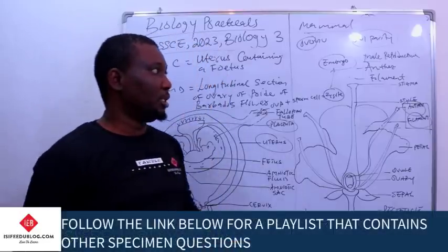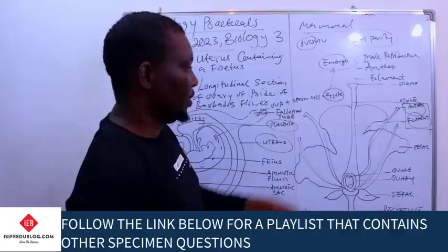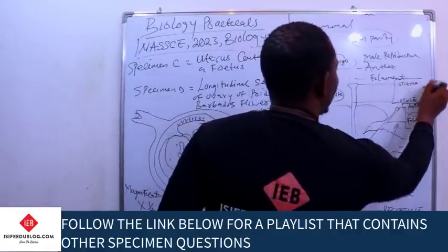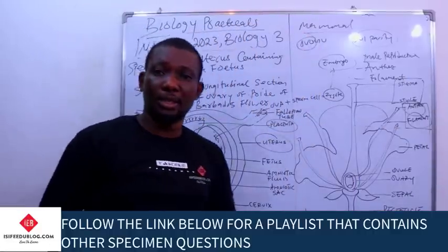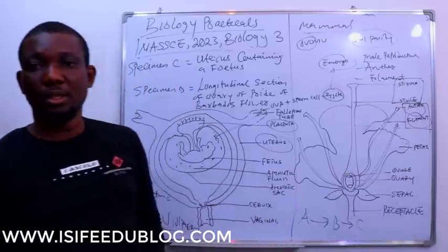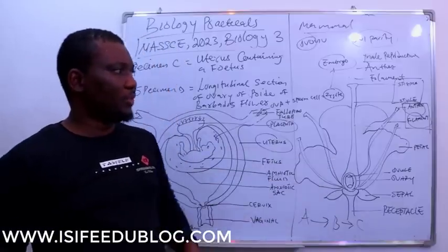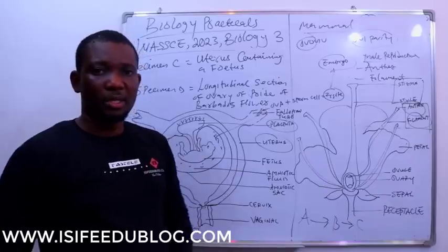Just like we have male reproductive, the two female reproductive organs of this flower are the stigma, look at them here, the stigma and then the style. The stigma and the style. This is the two female, this is the two male. Now look at how close both appear. Okay, let's look at the function of this reproductive organ because this flower reproduces sexually.